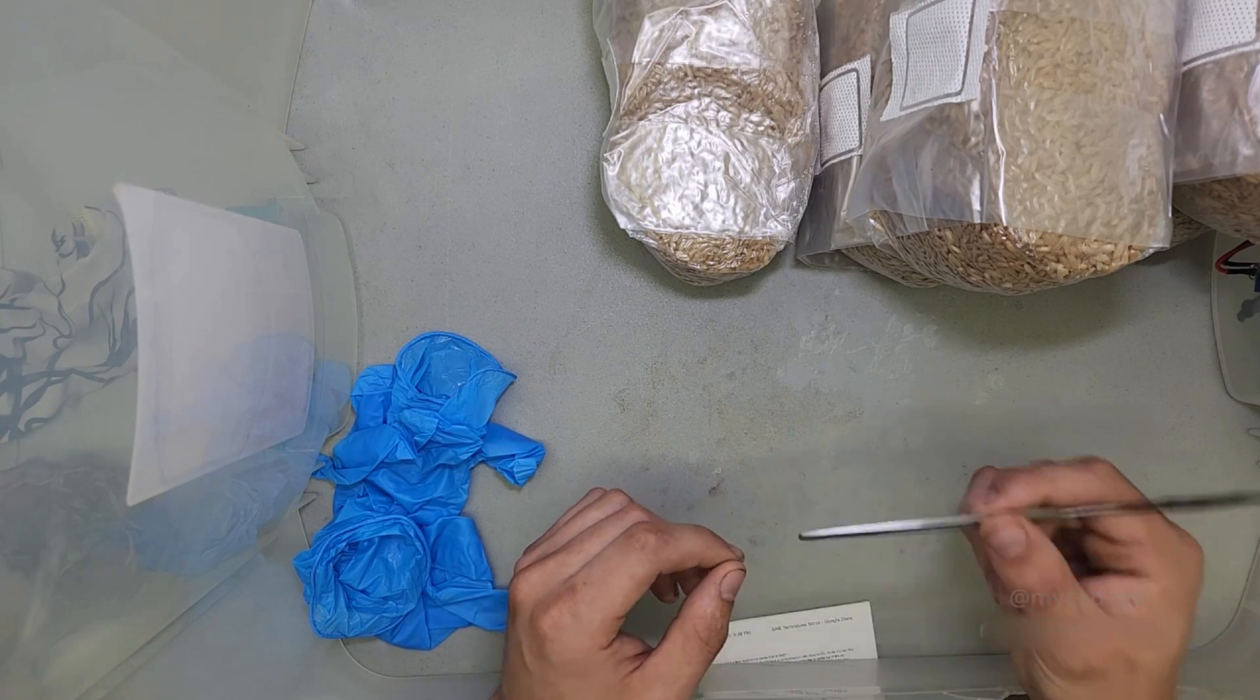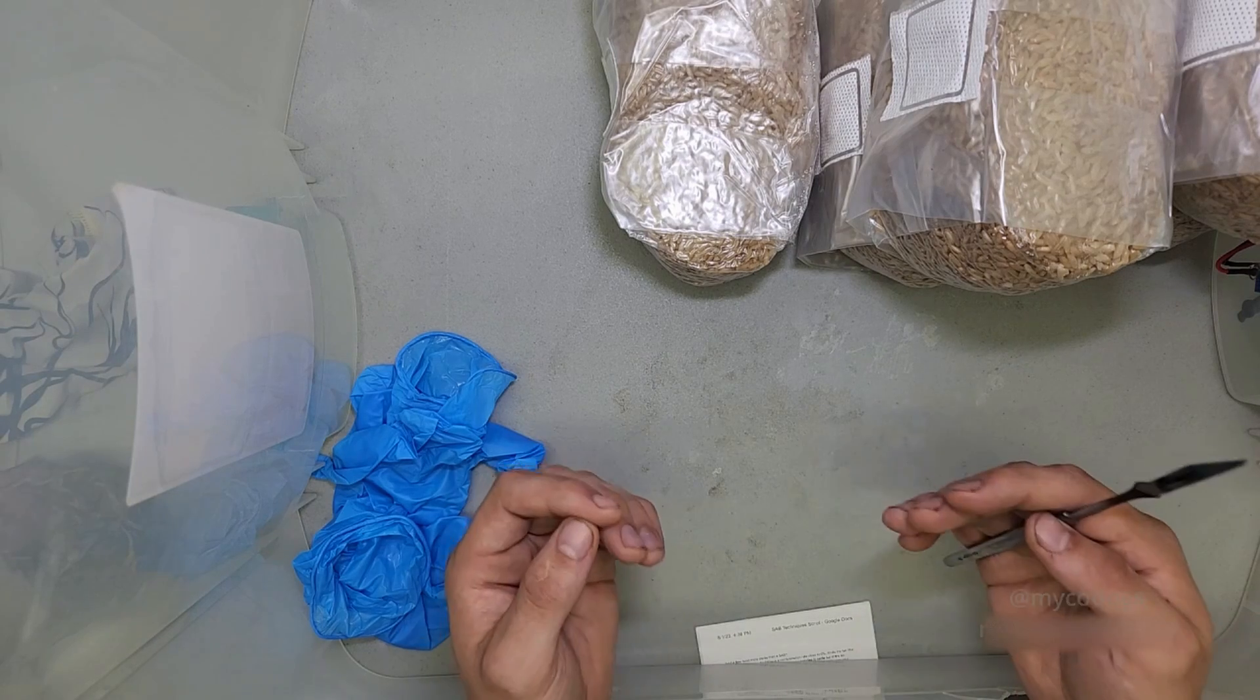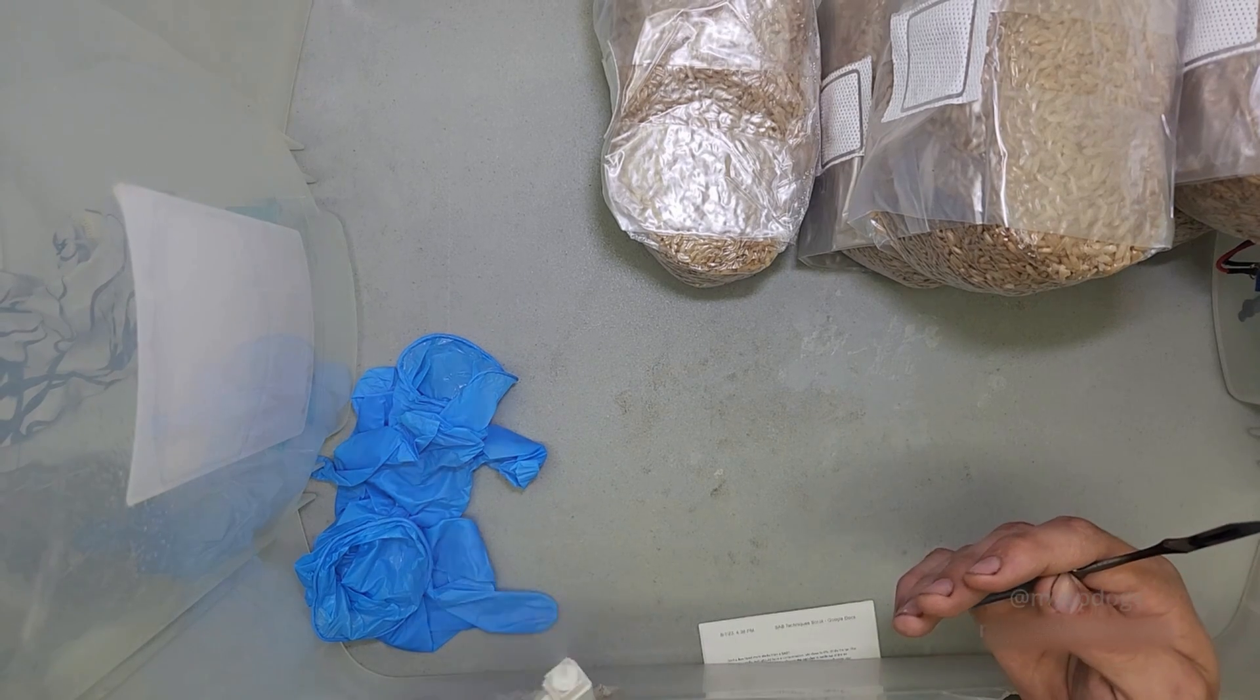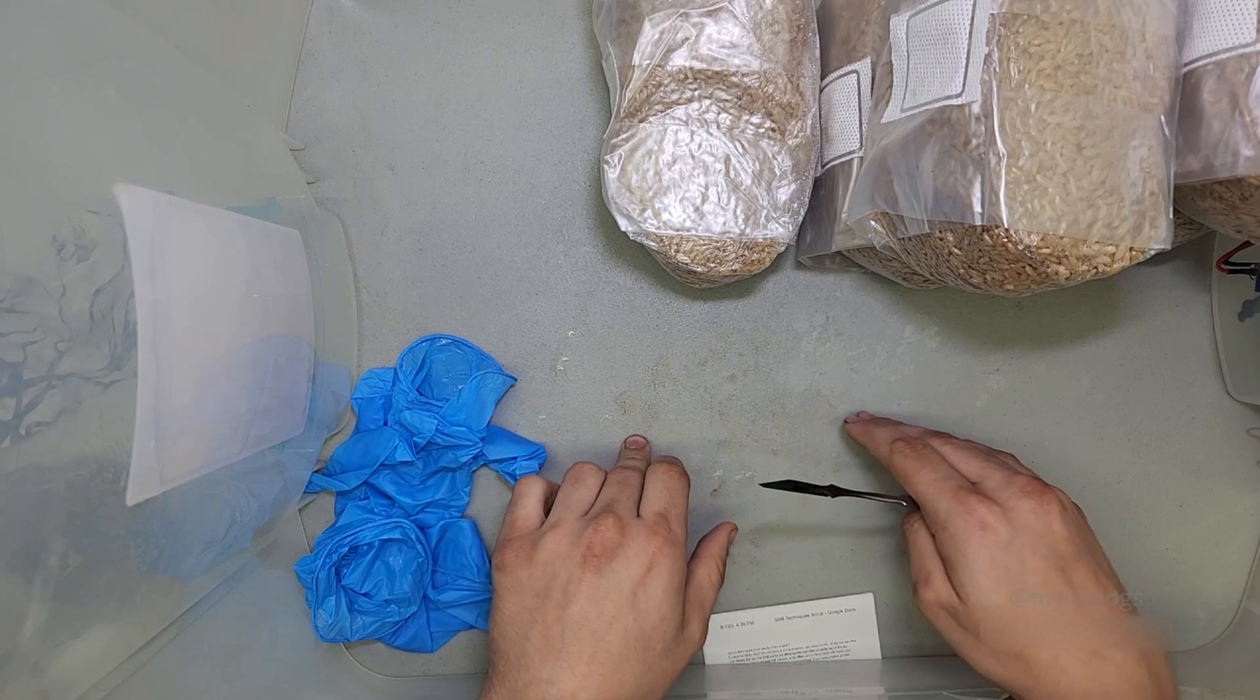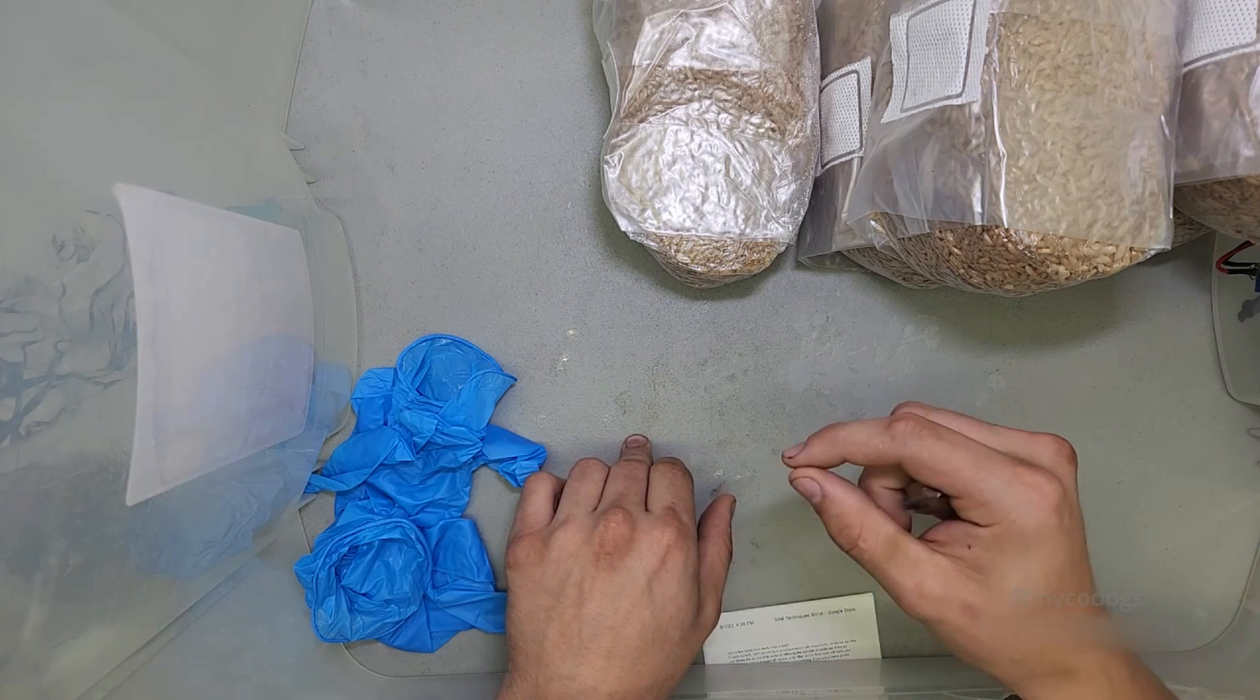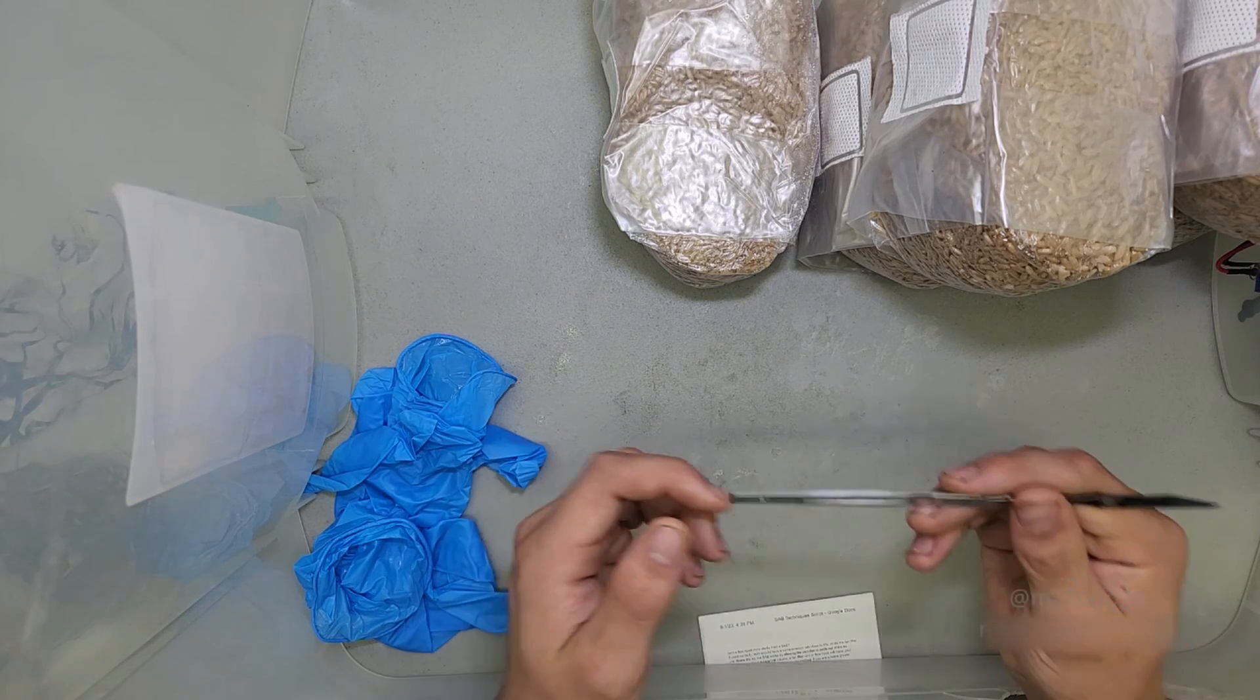I briefly touched earlier on how a still air box works. Every particle has mass and most particles are denser than air so if given a chance they will settle out of the air. When we're working in the still air box we want to make sure to regularly spray the inside that way the walls and surfaces stay slightly damp with the isopropyl mixture. When any endospores or bacteria fall out of the air and hit one of the surfaces they will stick to it due to surface tension and the isopropyl inside of it will hopefully kill the contamination.